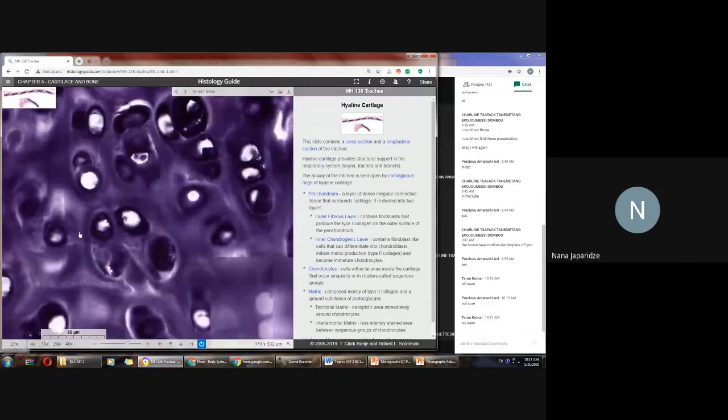you can see groups of cells too. Look, groups. And these groups contain several cells. It means that they are also derived from one cell, and they are able to divide. Okay, but again, they are not really able to separate from each other.